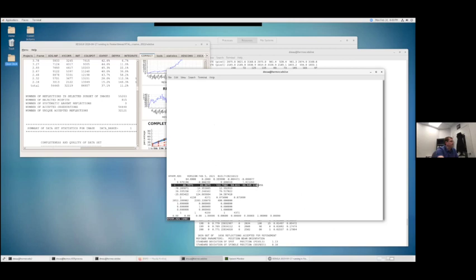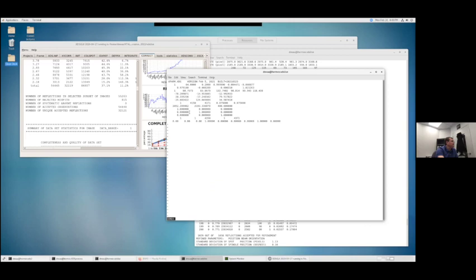This line here is space group and unit cell parameters, right? This is information about the detector parameters. So this is number of pixels, the 4150, 4371, and then the size of the pixels. And then this is the beam center and detector distance, okay?